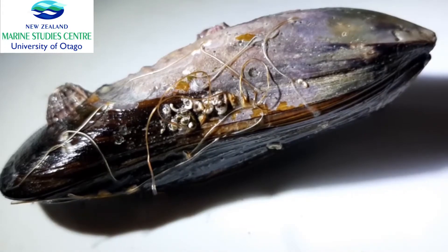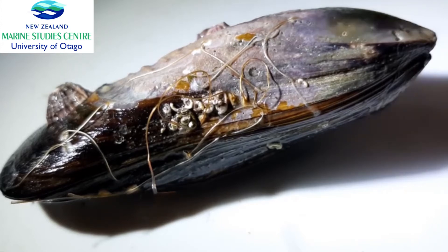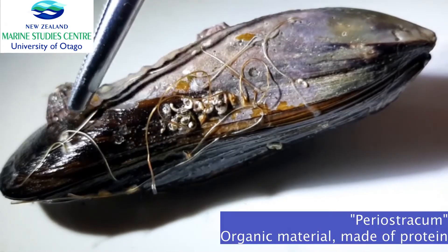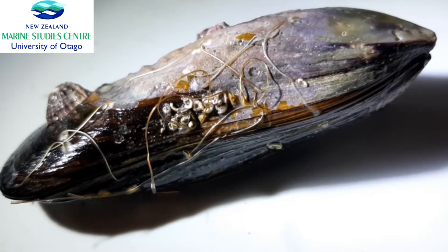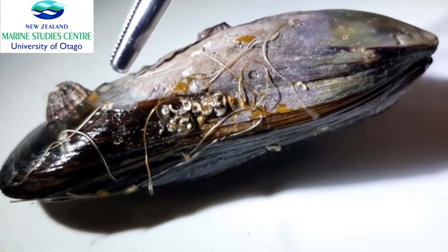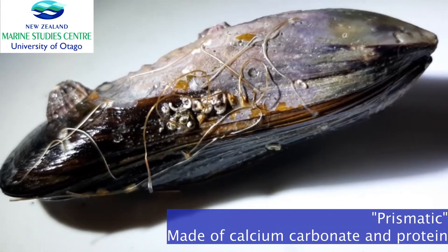We'll start by looking at the different layers that these shells are made up of — three different layers. The outer layer is called the periostracum, which is completely made up of organic material, a protein, meaning it's very much like our skin protecting whatever's underneath. The periostracum protects the next harder layer called the prismatic layer, which is made up of calcium carbonate and protein.